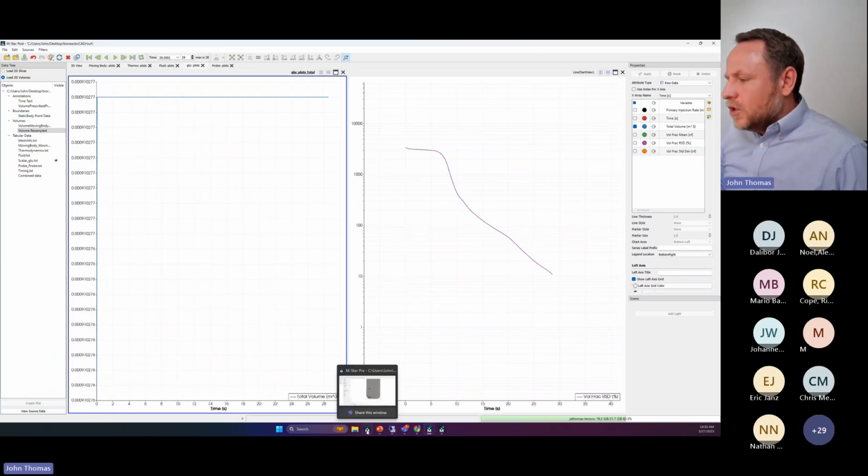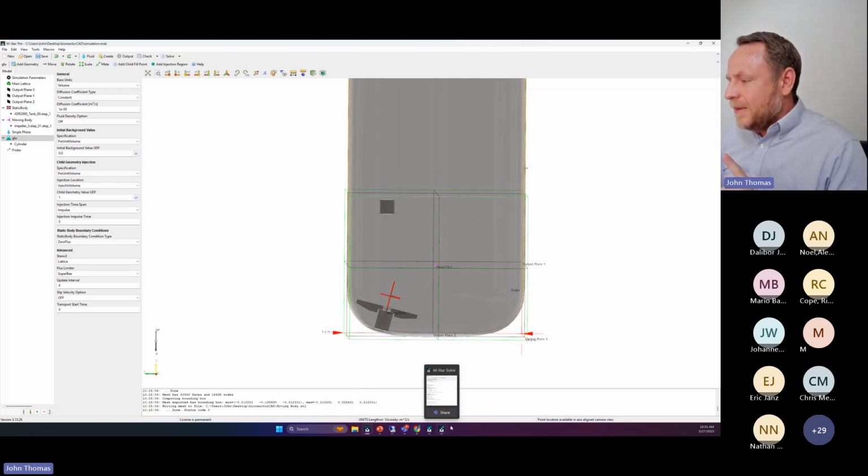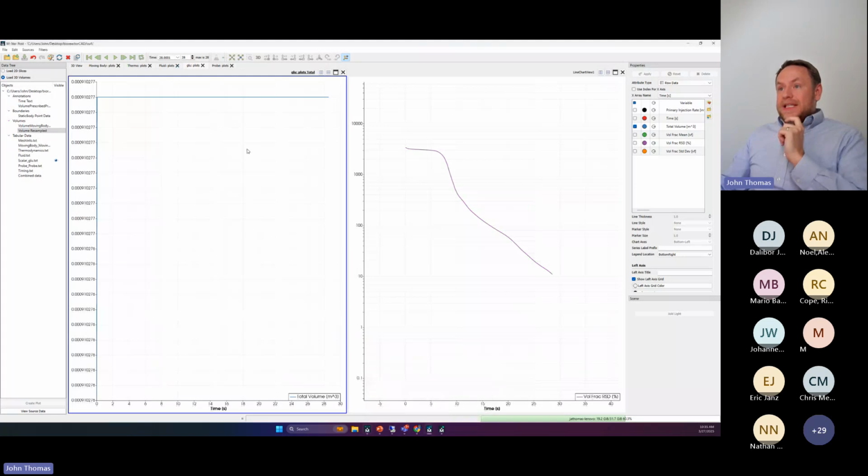Okay, so it's very easy to do these LES simulations, these glucose mixing simulations. And again, one more point of resolution here: is your resolution good enough? What should resolution be in LES simulation? Two points here. One, our power number is snapped into place. And I know it's going to work because I've written about this, both in our documentation and the literature, but you can test that and see the power number no longer converge to the resolution.